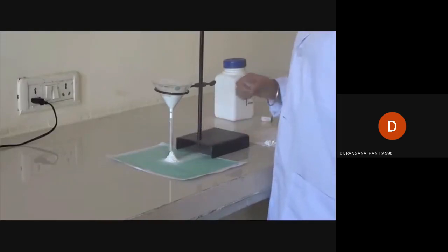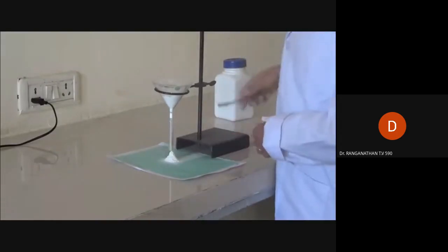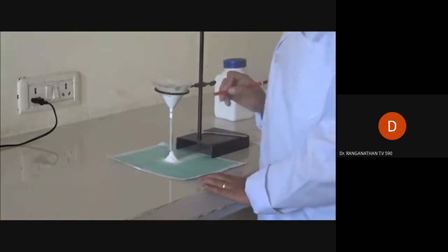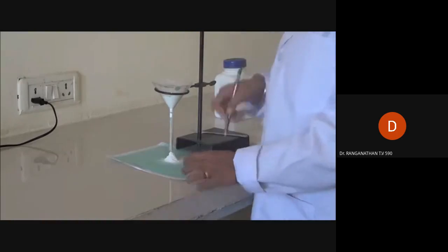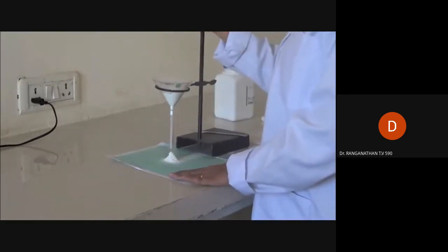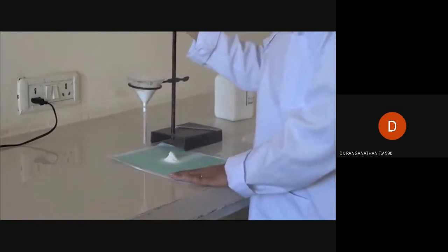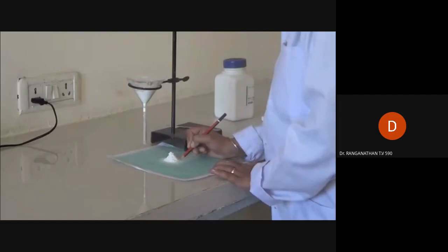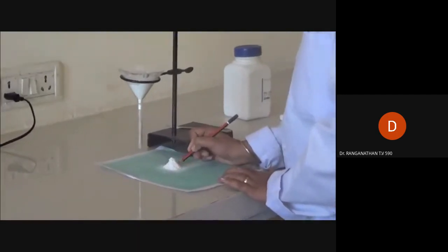So after that, you have to draw a circle around the pile such that maximum powder will come inside the circle.